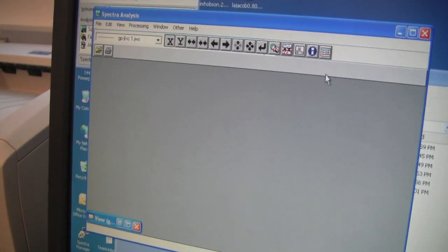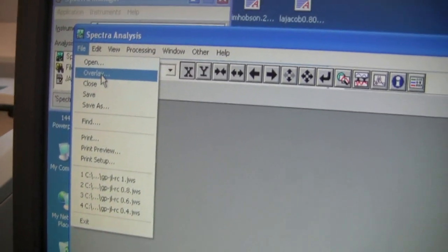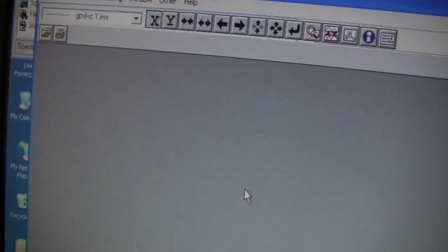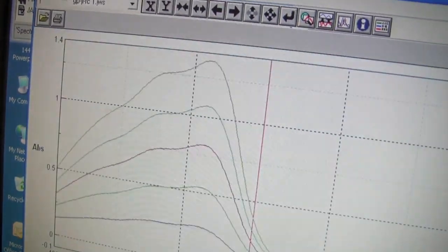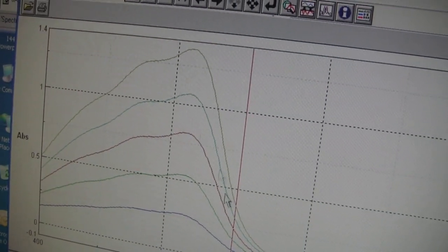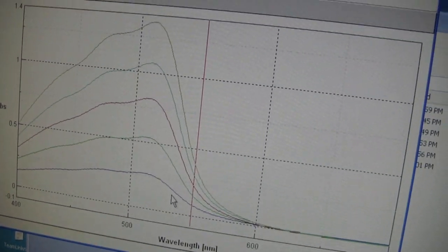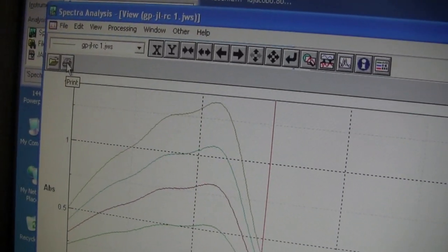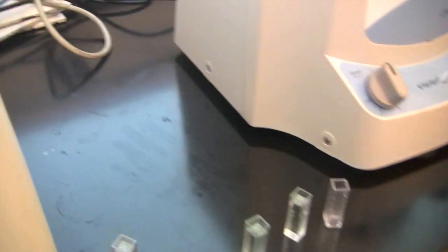Once you've saved all your files, click on File Overlay and find all your files separately until you have a graph with all your files overlaid on top of each other. After you have this, print this file, clicking the print button on the top left, print a copy for you and your lab partner.